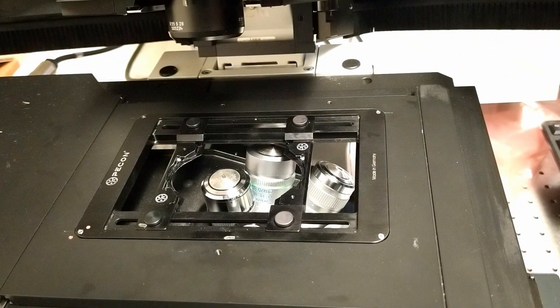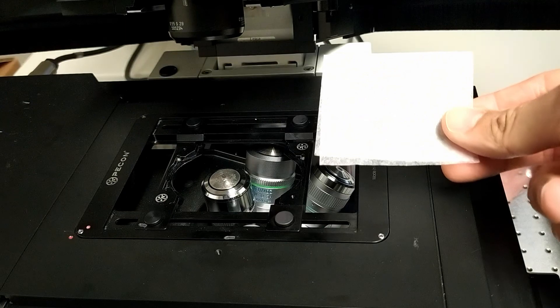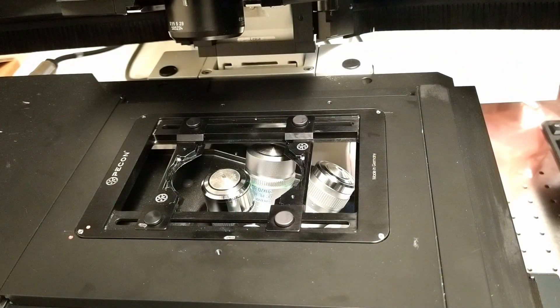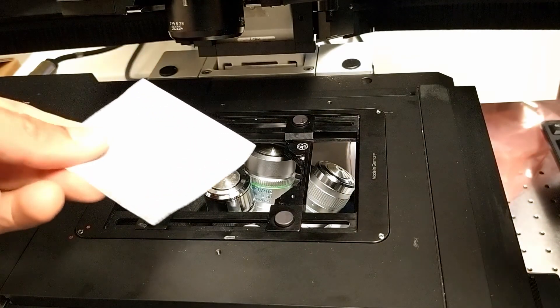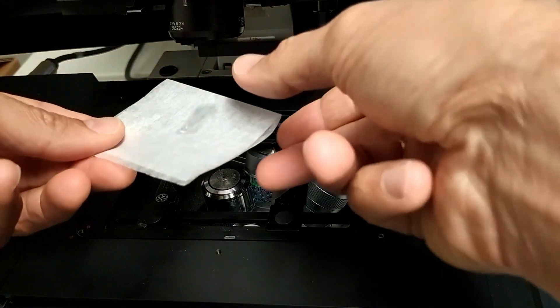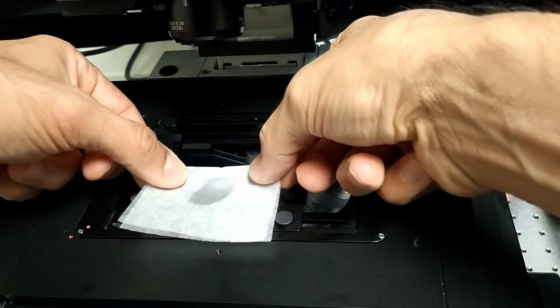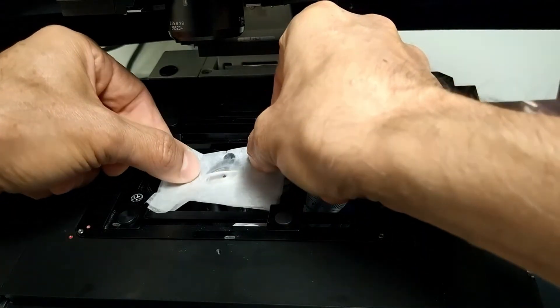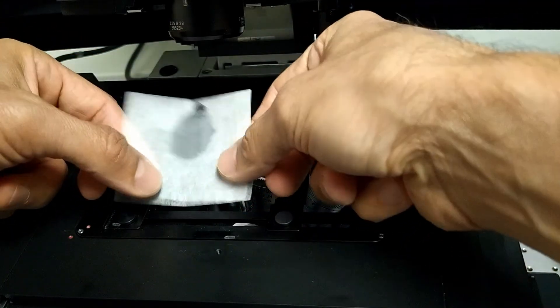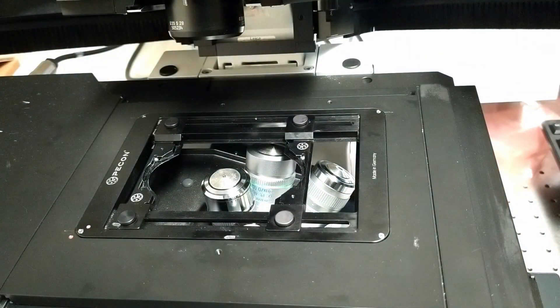Fold the tissue in half. Then from a dropper bottle next to the microscope, put one drop of lens cleaning solution onto the tissue. Slide the wet part of the tissue over the objective, and then do the same thing with the dry part — just slide it over to dry it off. That's all you have to do to clean the oil; there is no need for vigorous cleaning.